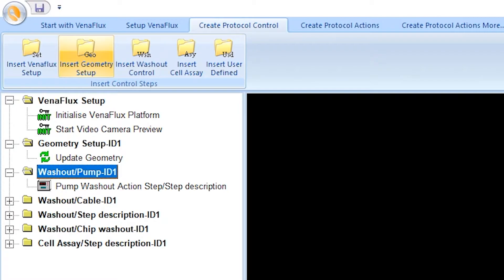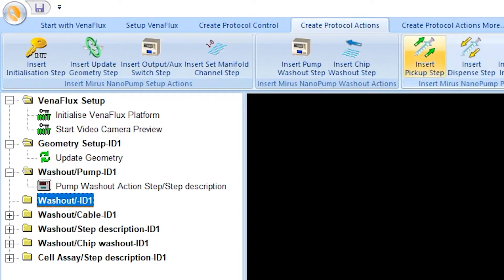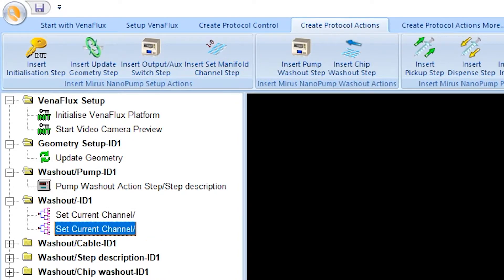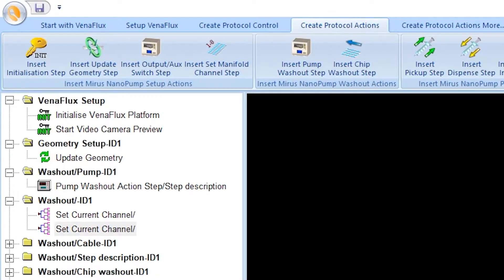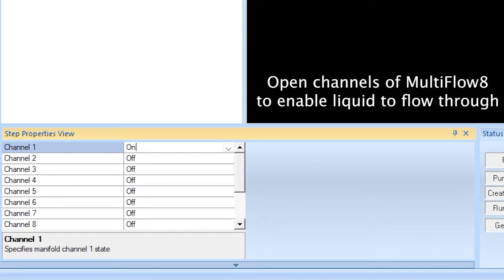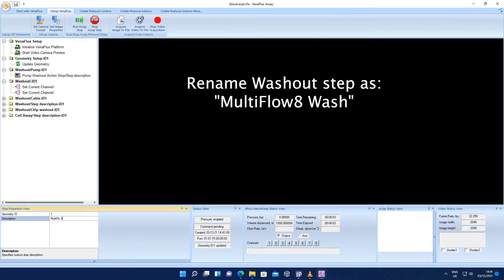Click the folder icon Insert washout control. Go to the main menu again and click on the tab Create protocol actions. Click the action Insert set manifold channel step and repeat this step twice. This allows you to set each of the Multiflow 8 channels in the on or off position. By default, the channels are always in the off position. Click on the first action Set current channel to reveal the step properties below. For each channel, change the position to On. Go to the main menu, click on the tab Set up Venaflux, and click Run assay step with the green arrow. You can rename this washout step as Multiflow 8 wash.